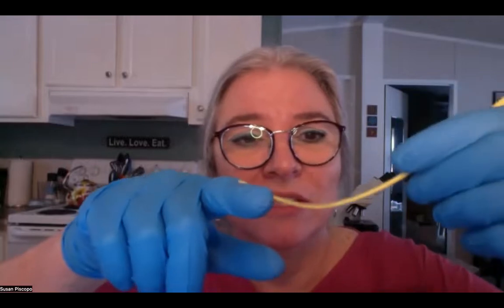It's solid and we can grow things on the surface of it, but it's not hard. So we have to be gentle when we run our loop over it, because if we're not careful, we'll poke into it and under it. Okay. Some people think that these are harder to use because they don't bend. They're not as flexible. You can see there is some flexibility though. You just have to practice so you know how much pressure to apply and to not apply when you're using agar.